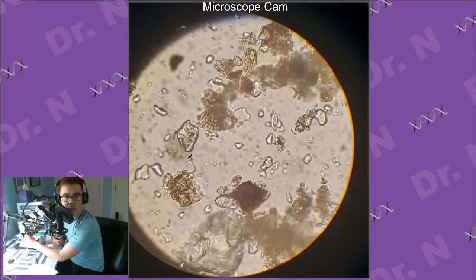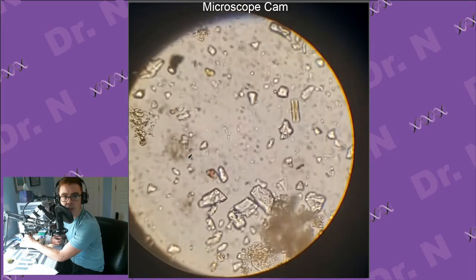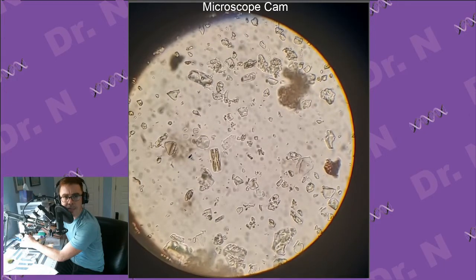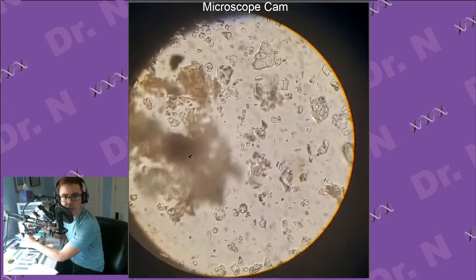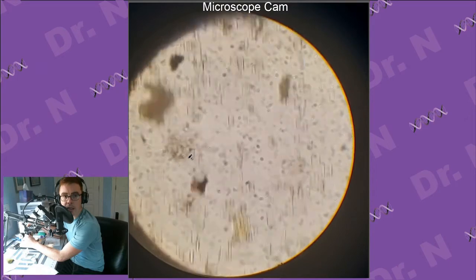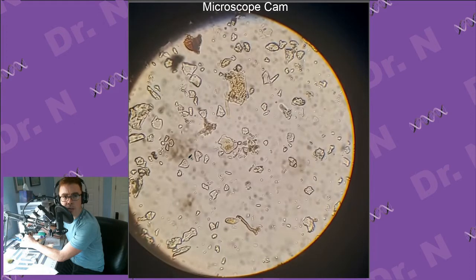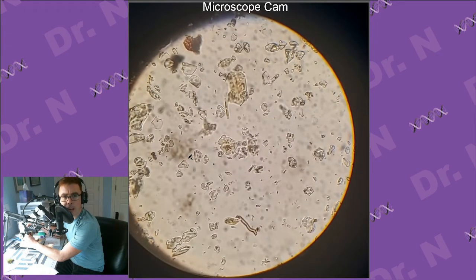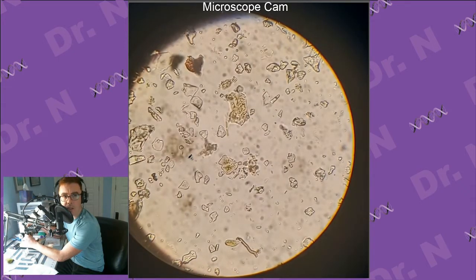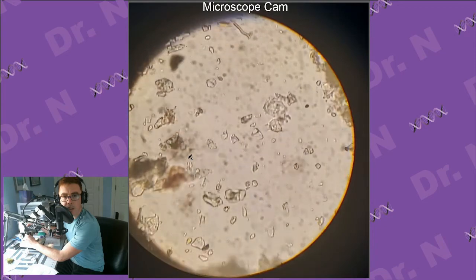So that little guy is kind of cool. He's very big, too. I don't know if they know. Oh, that might be another one. Oh. It's got kind of a different structure, but similar thing. Probably photosynthetic. Those are going to be the easiest ones to find in this, because some of these blobs very easily could be living cells, but if they're not moving, it's kind of hard to tell. Like here we have kind of a group of things that have sort of an amoeba shape, in that they don't have quite a defined outside, but they have that sort of coloration. And a printer is going off in my room. So, sorry for that.